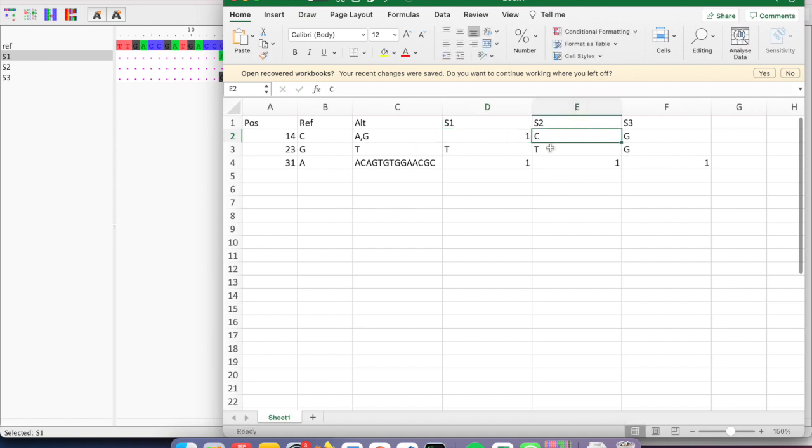Now here, this is actually the reference allele. So what we do here is we code it as 0. And here, it's an alternate, but it's not an A, it's a G, which is the second alternate. So in this case, we use 2. And then here again, alternate 1, and 0. So now you can see that the number of characters that we've used in the entire table is a lot fewer just by changing to this numbering scheme.